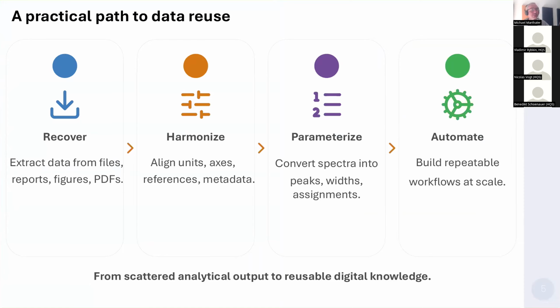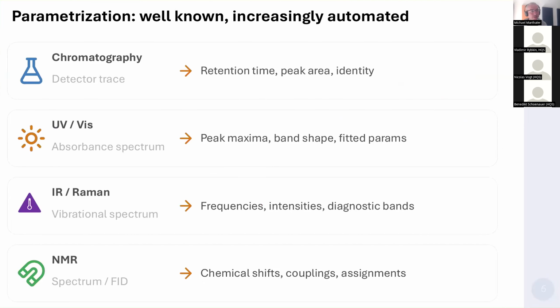And, out of these steps, I guess these steps are pretty self-explanatory to some extent, but one might not be self-explanatory, and that is the parameterization. Parameterization is, of course, to some extent well known, but of course, you can also automate it or make it more thorough. So let me also explain a little bit what we mean when we say parameterization.